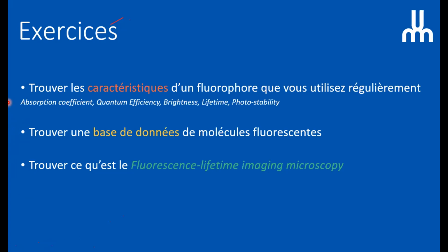So FITC has an extinction coefficient of 78,000, and this gives a brightness of 77 if you multiply both of them. So the second question of the talk is to find a database of molecules that are listed by their absorption coefficient and quantum efficiency.